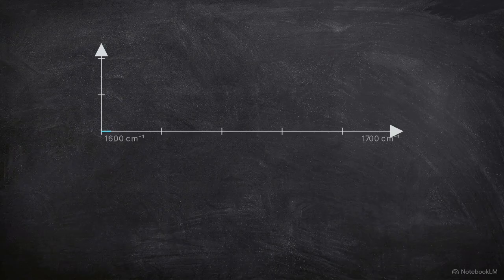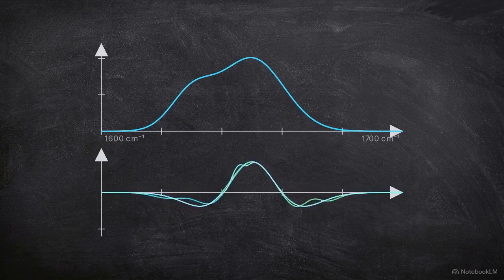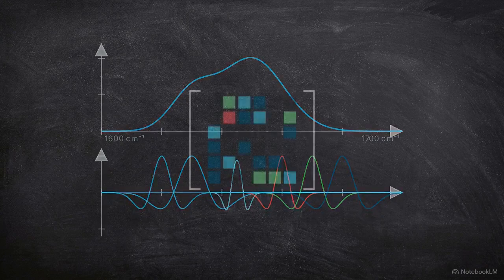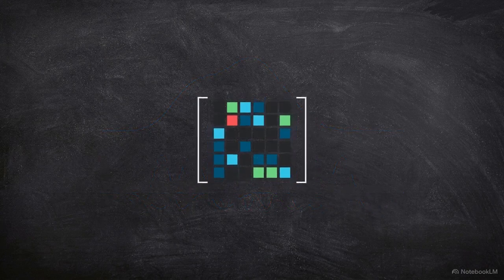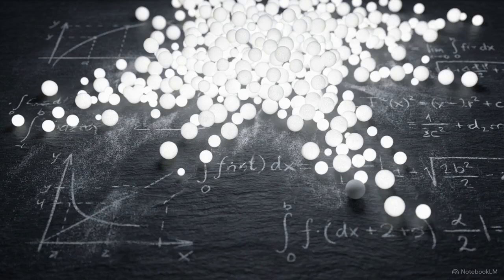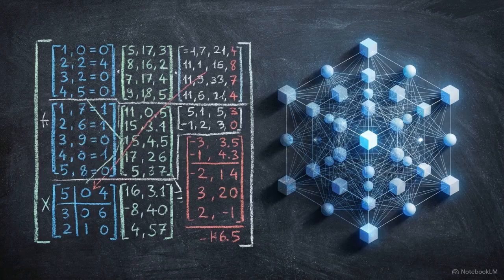This animation shows the mechanics of the transform, breaking the smooth curve apart into a series of smaller, staggered, and localized wavelets by applying mathematical scaling and shifting. This matrix reduces the data size while retaining the structural geometries of the original protein. By shrinking thousands of data points into a dense mathematical summary, the wavelet transform bridges the gap between high-dimensional physical data and the strict input limits of small dataset machine learning.